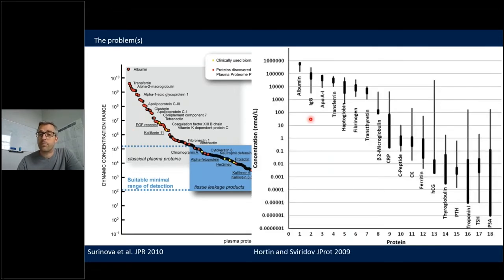Another one is that the proteins themselves also vary over a really high dynamic range between, for example, patient samples. Here we have one of the best known biomarkers, PSA, which spans a concentration range of 4 or 5 or more orders of magnitude. The same is true for other known biomarkers, for example CRP, where we easily span 3 orders of magnitude from baseline as compared to a clinical condition, like some autoimmune diseases. So that is a second big problem that we face in plasma proteomics.